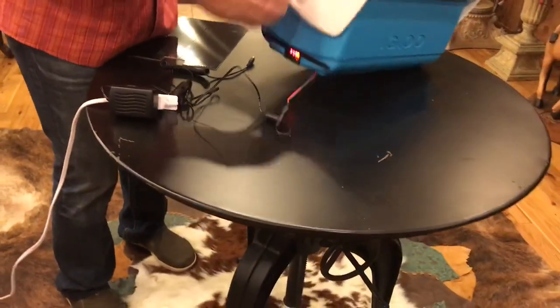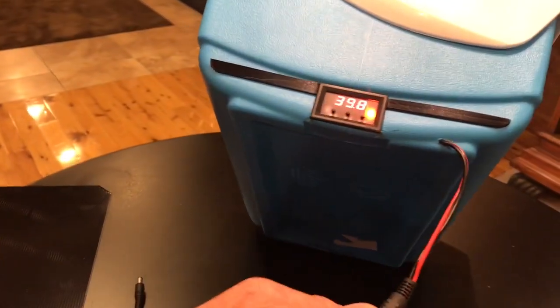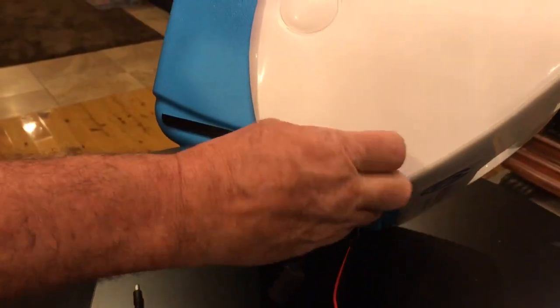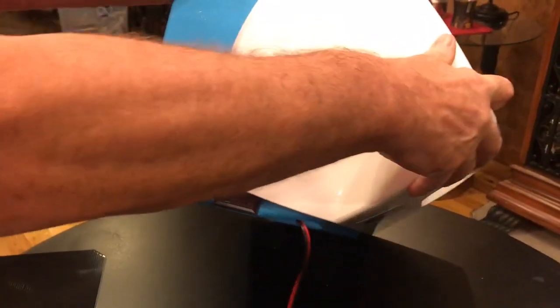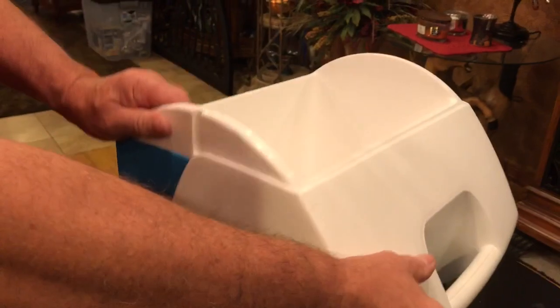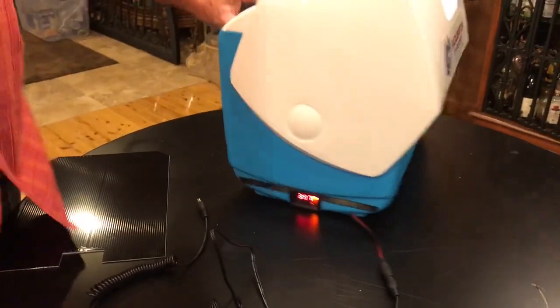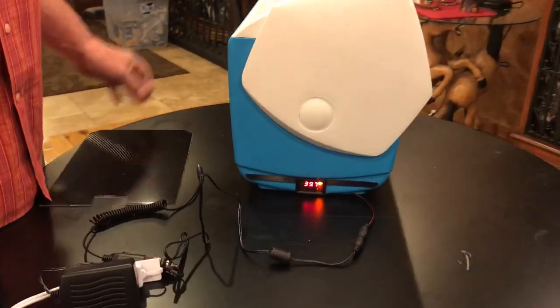And we also changed the plug. Before it had a little plug-in plug for this, but there was a problem when that plug was sitting like this. If you let this lid spin all the way down, it could hit this plug and break the plug. Now if you do that, it doesn't go past that, and it doesn't hurt anything. So that's another minor improvement. But you unplugged it. That's what I was going to say. Oh, the light's off. Yes, he unplugged it.